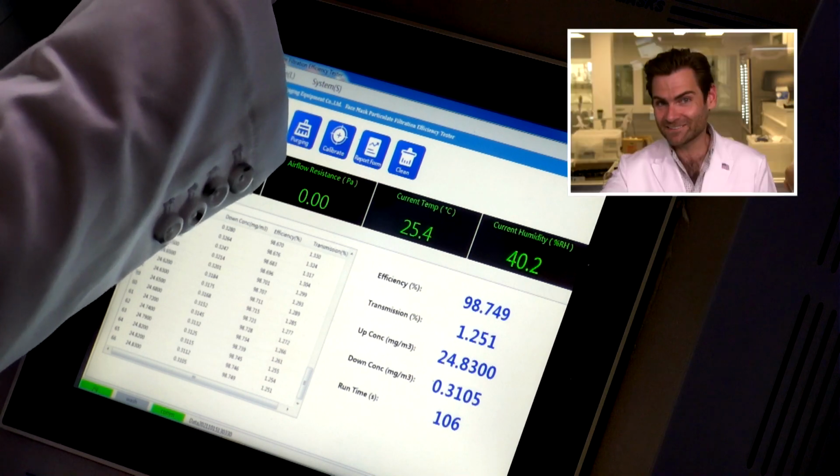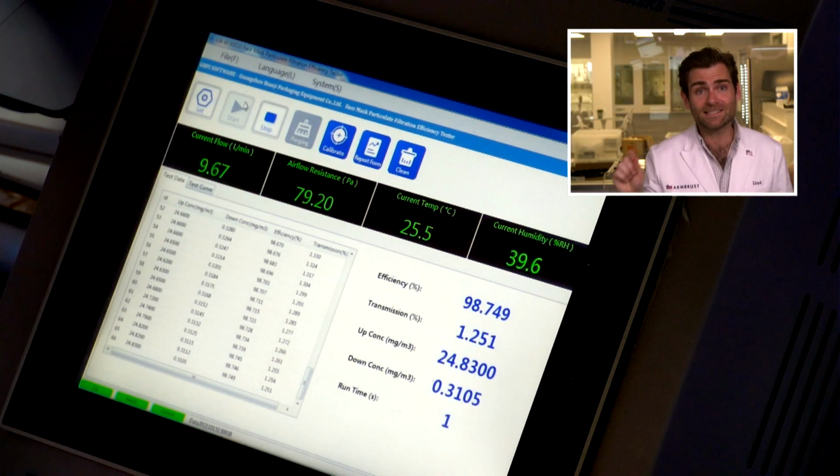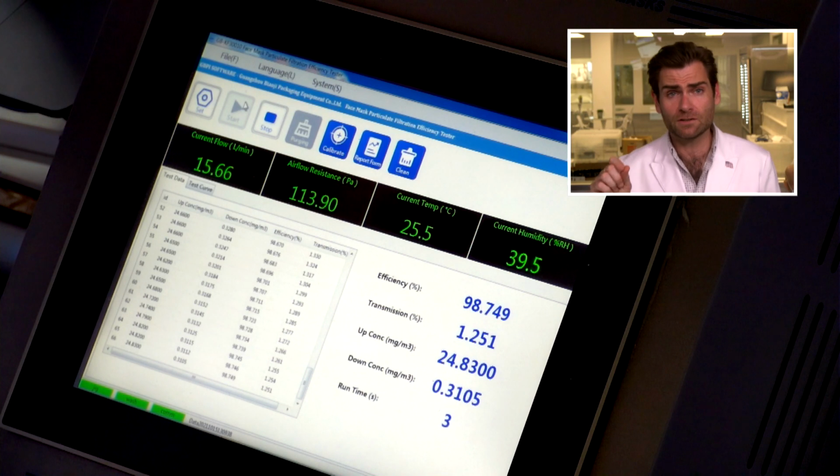All right, let's get this thing going. This is a PFE machine, Particulate Filtration Efficiency machine. If you want to find out more about this, I'm going to put a link up here.